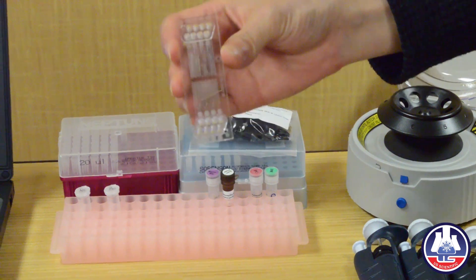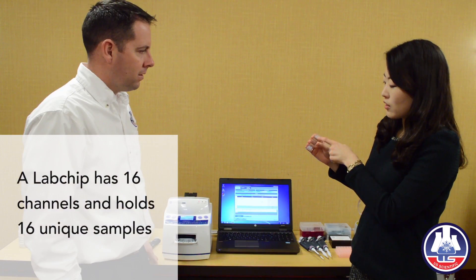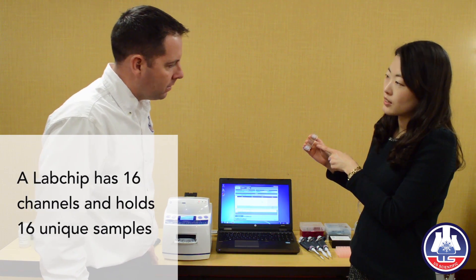This is the electrical connection for our real-time PCR. One channel is for one sample, and this is totally 16 samples.